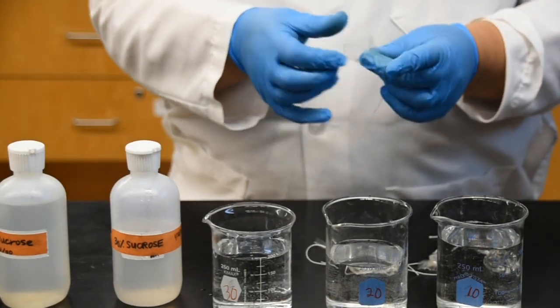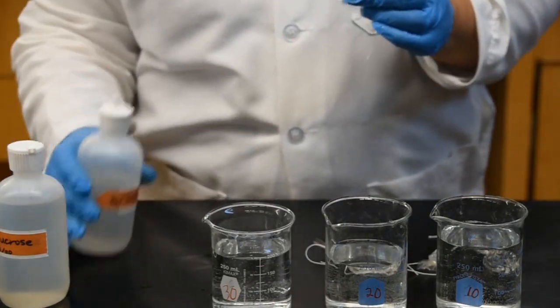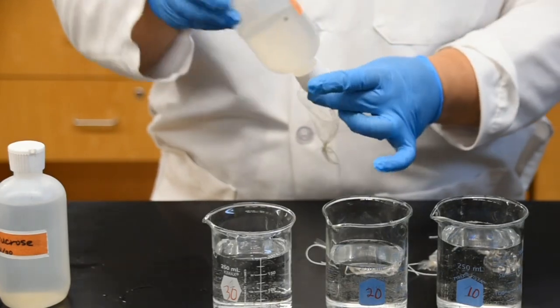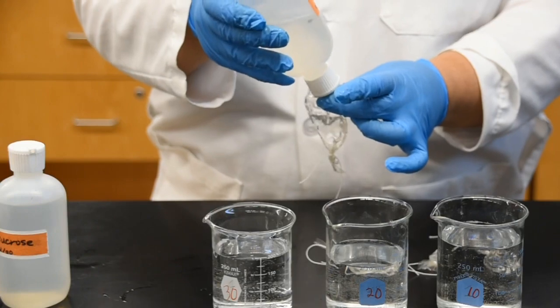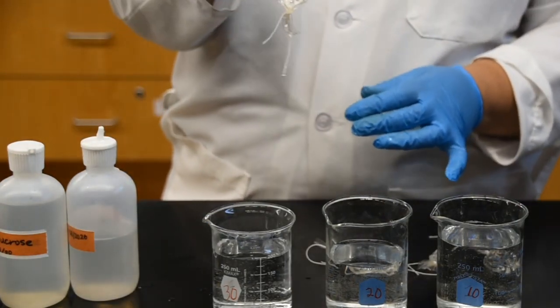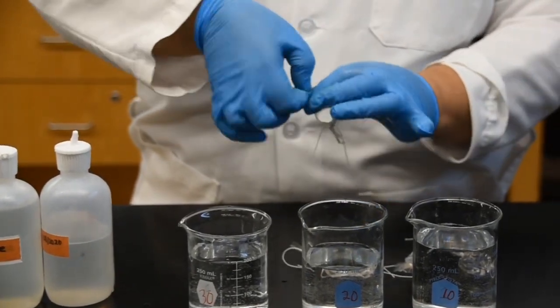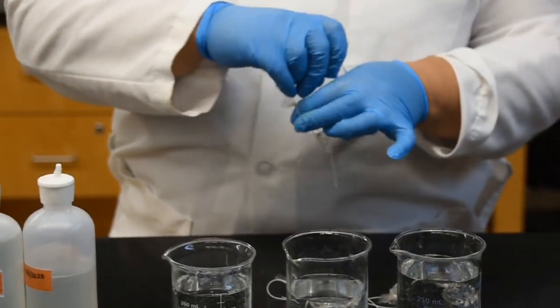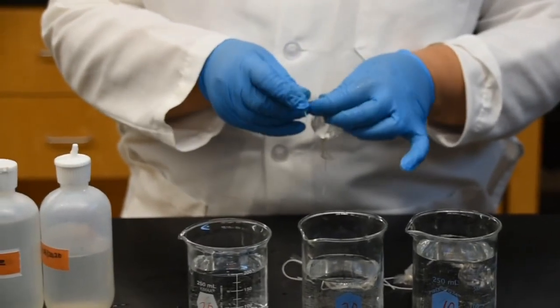So I'm going to open up my little baggie, mix my sucrose solution, and then add the fluid. You don't want to bring it all the way to the top, because if you do that, then you don't really have the option of adding any water as the experiment starts. So see, I have about an inch empty on the top. Then I'm going to twist again, twist, twist, and close the other side as well. It's literally like closing a piece of candy.